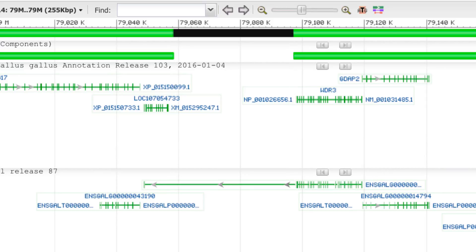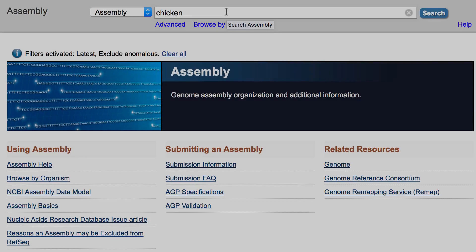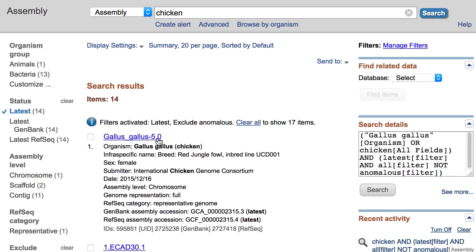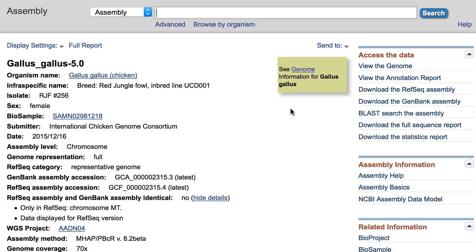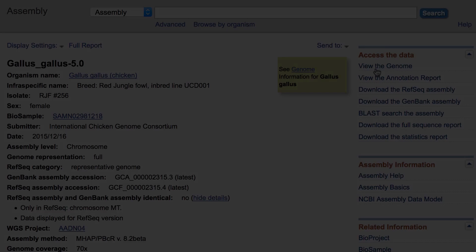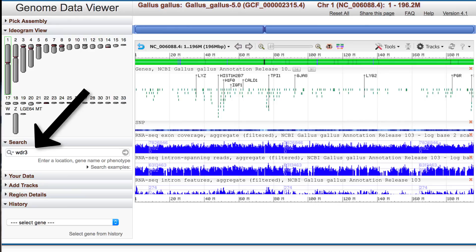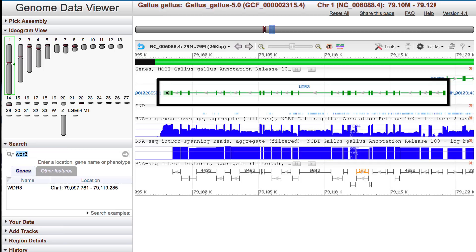To examine this further, let's use another tool, the Genome Data Viewer. Currently, the GDV is best accessed through the organism's assembly page, so I'll search assembly for chicken and select the Gallus-Gallus 5.0 assembly. Here we have a link, View the genome, in the upper right. I'll click that, and we are now in the Genome Data Viewer. To get to the WDR3 gene region, use the search box on the left. We now see the WDR3 gene model.